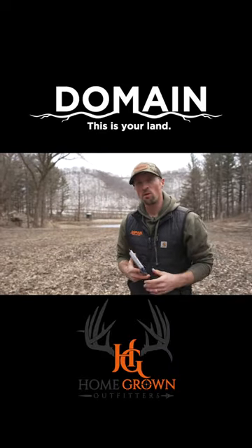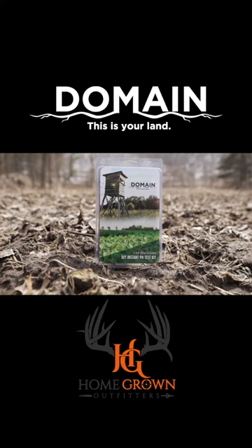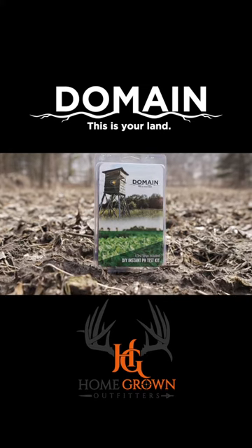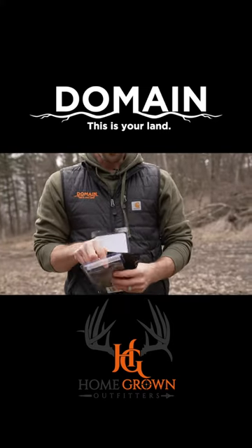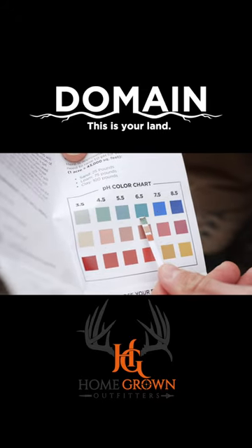Don't have time to mail your soil into a lab? We've got our own do-it-yourself instant soil test kit that you take up to the field and get your results in 15 minutes. Let me quickly show you how it's done. Inside each test you're going to get four strips, so you can test four separate plots.